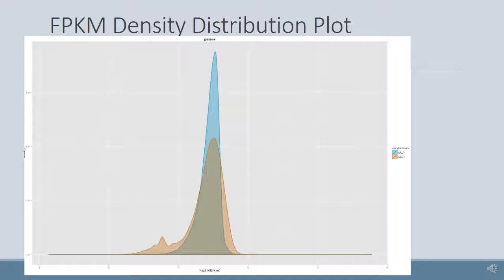I'll try to simplify that. It really means the rate of fragments per base multiplied by a really big number, so that we can try to get some sort of sense as to how often our reads mapped to the reference.